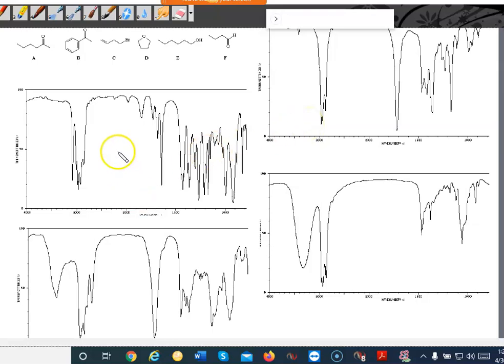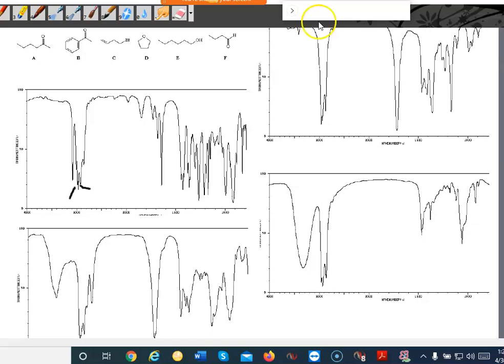Okay, so this one, let's see, we definitely have aliphatic and aromatic. So we definitely have aromatic here, and we have aliphatic here. 15, 16, 17, possibly carbonyl. A few of these are a little bit harder to analyze, and that's kind of the point of these, just to show you that it doesn't have to be as straightforward and cut and dry.